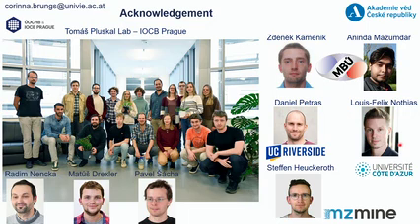So now we have acquired almost 4 million MSn spectra, and for MS2 it's about 350,000. Before, you saw in MoNA it was, how much was it, 150,000 spectra. So you can actually help and improve the library building and annotation a lot if we all collaborate together.